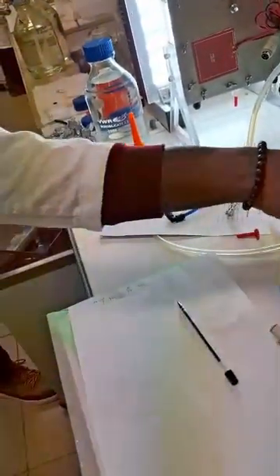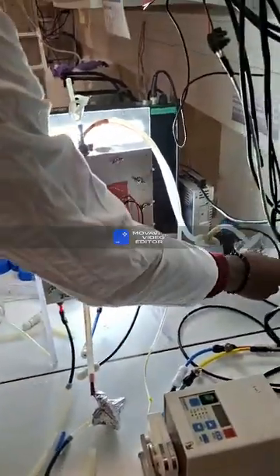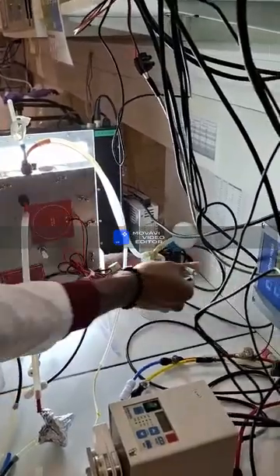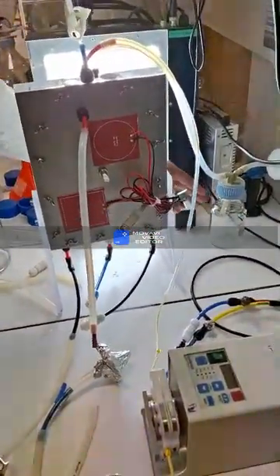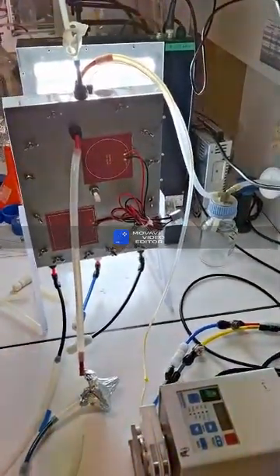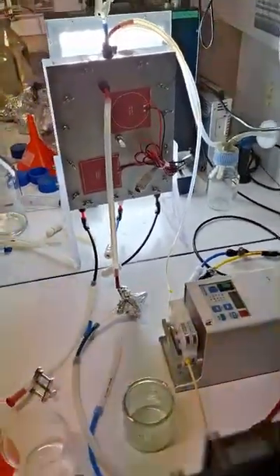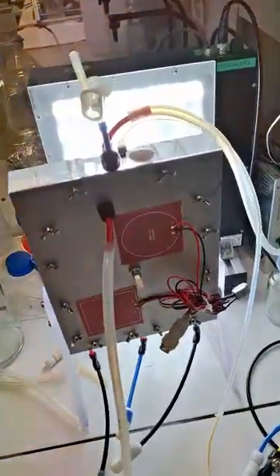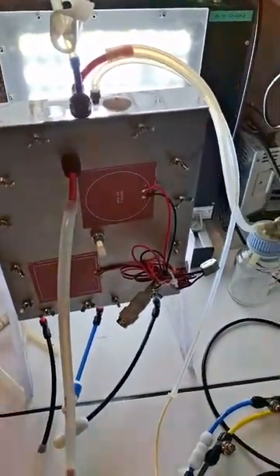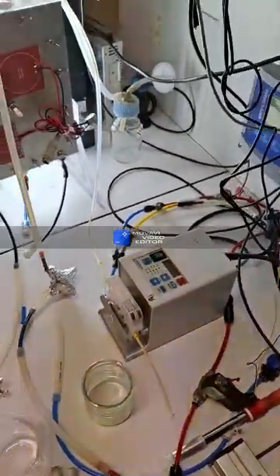Here we have a specific move. It's a security. Automatically it will remove foam if you put it like this, because sometimes if you have a lot of bubbles inside your cultures, and if your culture is old, you can have foaming formation due to the polysaccharides, etc.